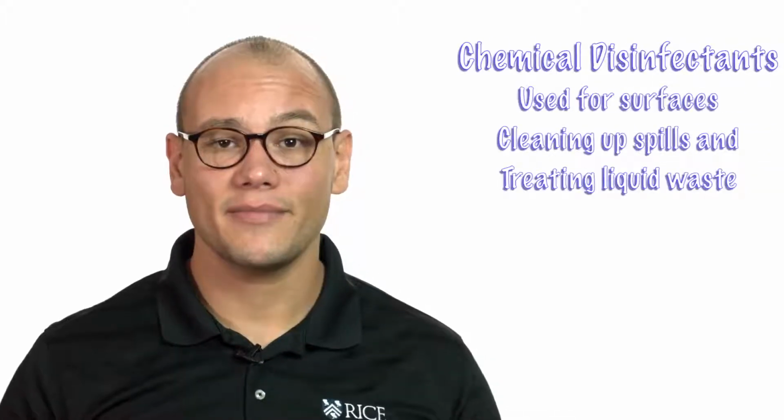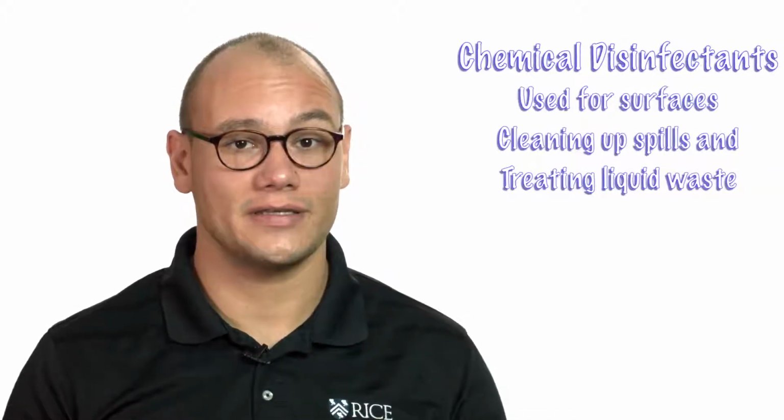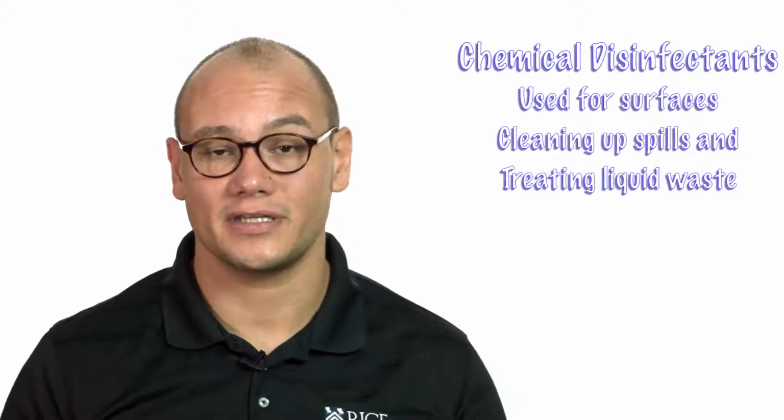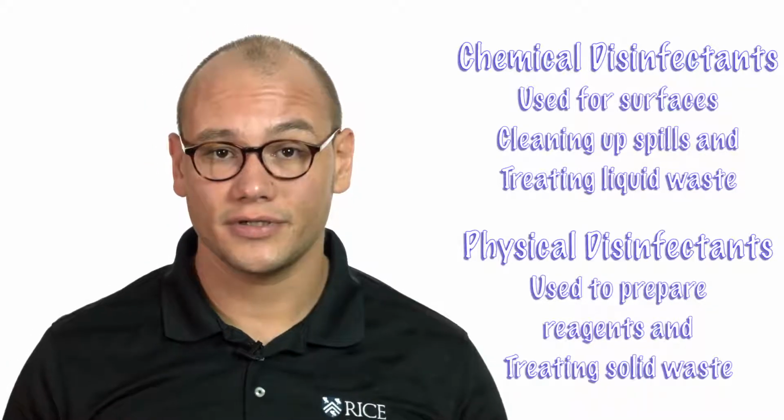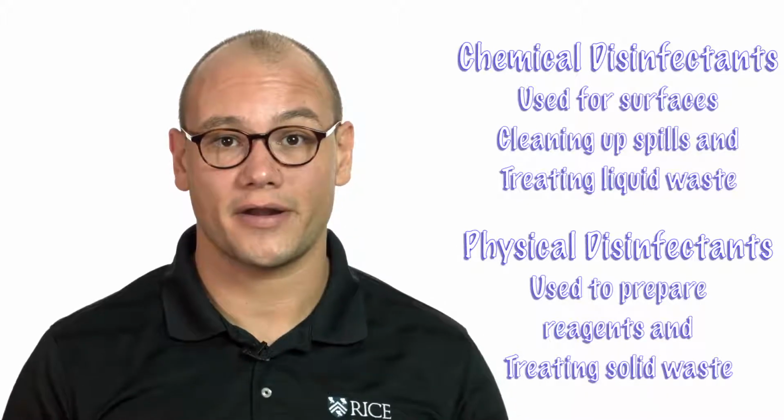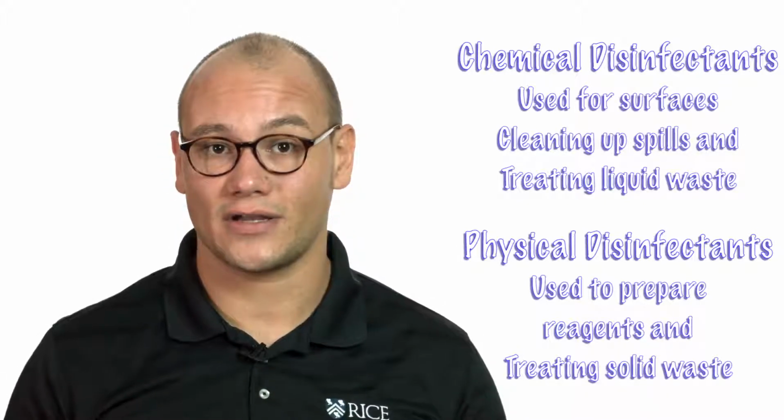Now that we've covered physical and chemical disinfection, you might be wondering, when's the right time to use it? Chemical disinfectants are perfect for cleaning surfaces. This makes them ideal for cleaning up a spill or treating liquid waste. Physical disinfection, or using an autoclave, is great for preparing reagents as well as getting rid of solid waste generated in the laboratory.